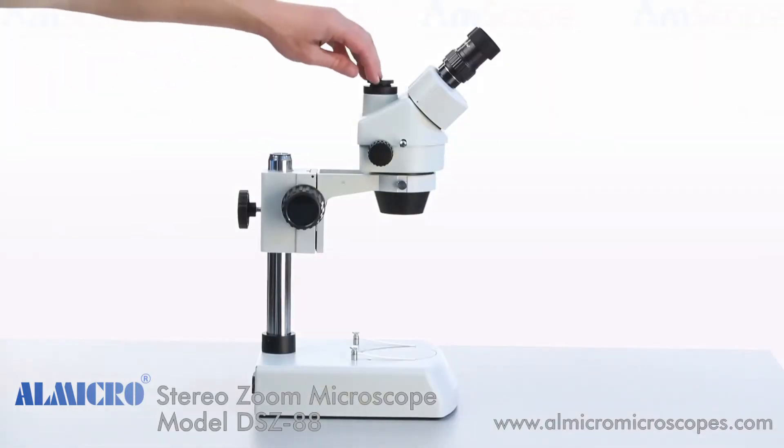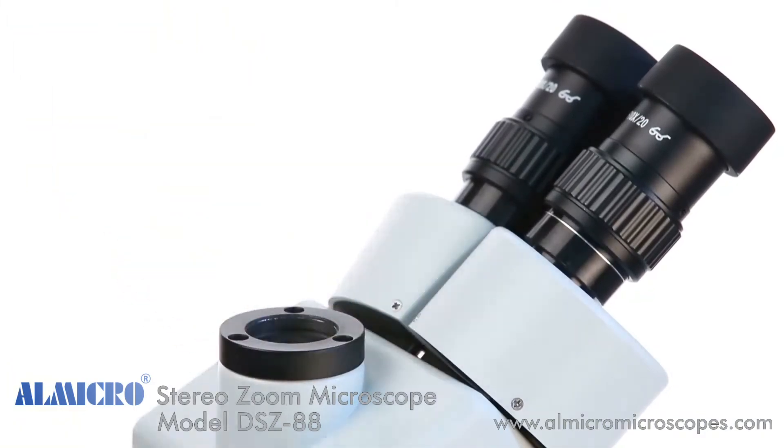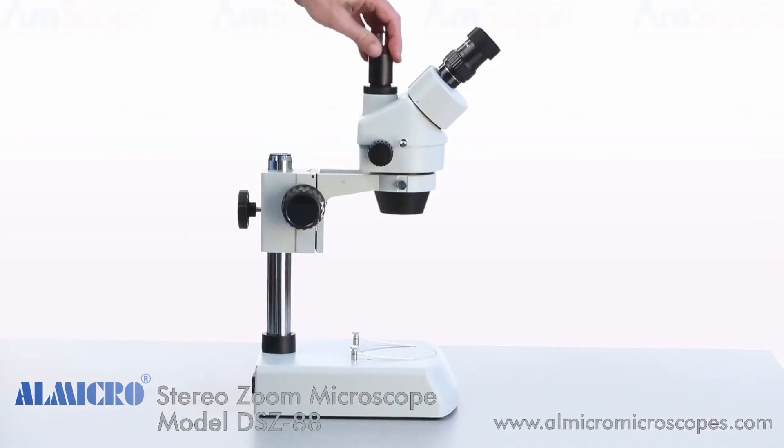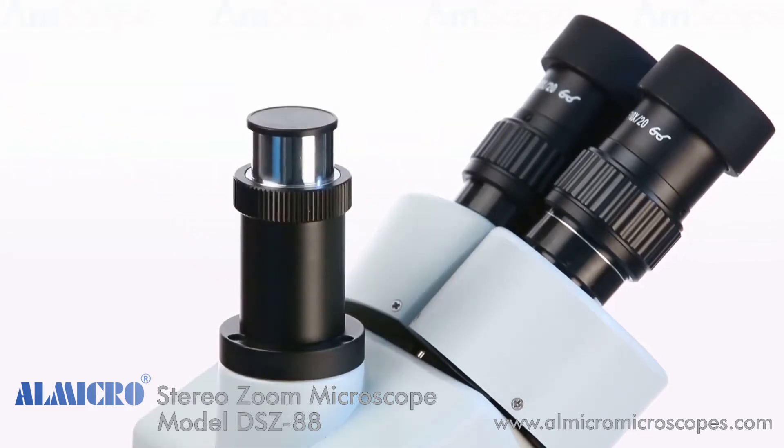Now we'll attach the trinocular viewing port. Start by unscrewing the viewing port's dust cap, then screw the trinocular port into the threaded opening. To attach a camera, simply remove the port's dust cap.